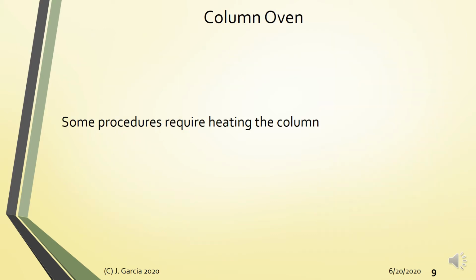The column for HPLC can also be thermostated inside a column oven, although not as essential as in gas chromatography. In gas chromatography, the purpose of heating the column or its environment is to ensure that your analyte is in the vapor phase. But for liquid chromatography, there is no such requirement.